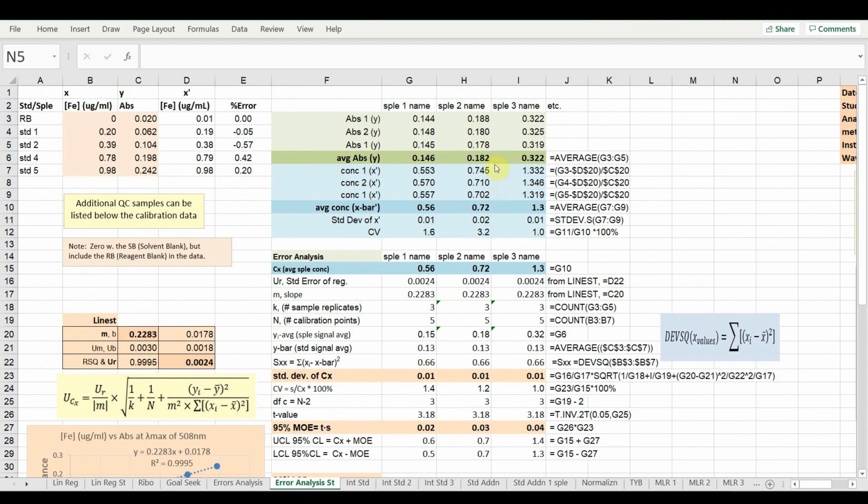What we do is we look at it and say, what's happening here? It looks like the first replicate is somewhat higher than the second two. Perhaps the glassware wasn't as clean here. Probably what the student should do is run a couple more of these replicates to get a better measure on precision. So stats doesn't necessarily tell you why results are varying, but they give you a way to honestly and logically evaluate the data. And then it's up to the technologist to figure out the why and how to correct the errors and how to minimize the variation.